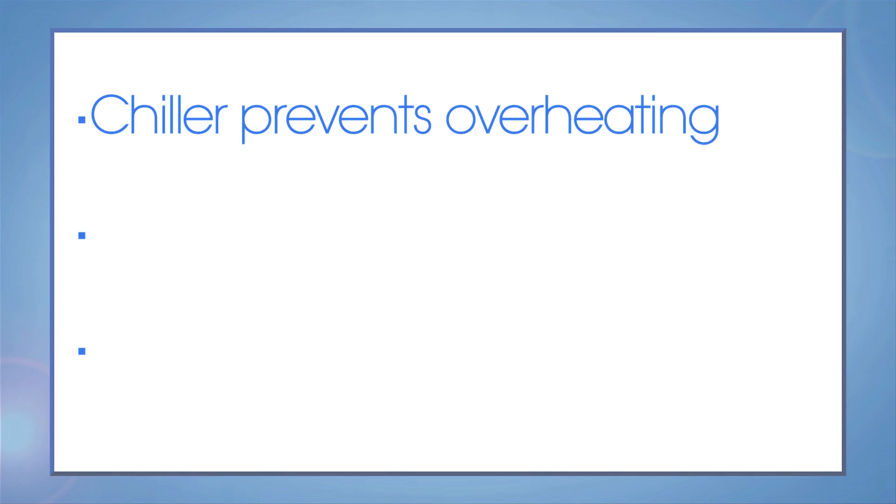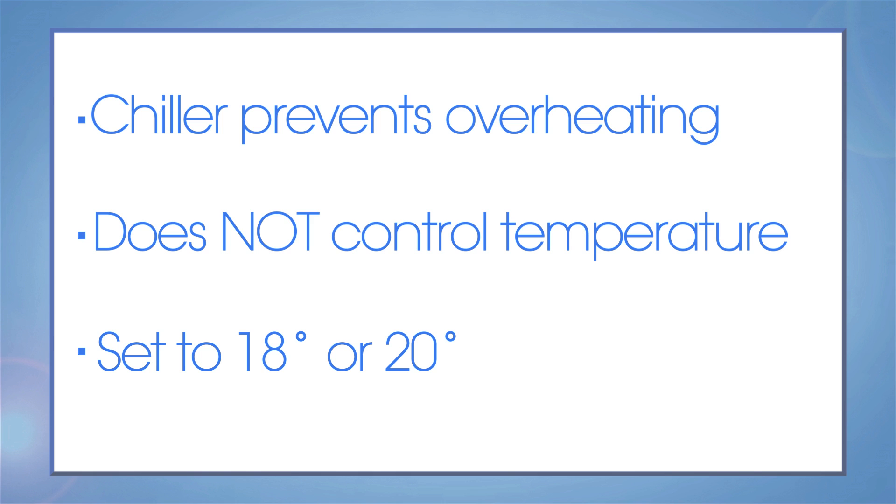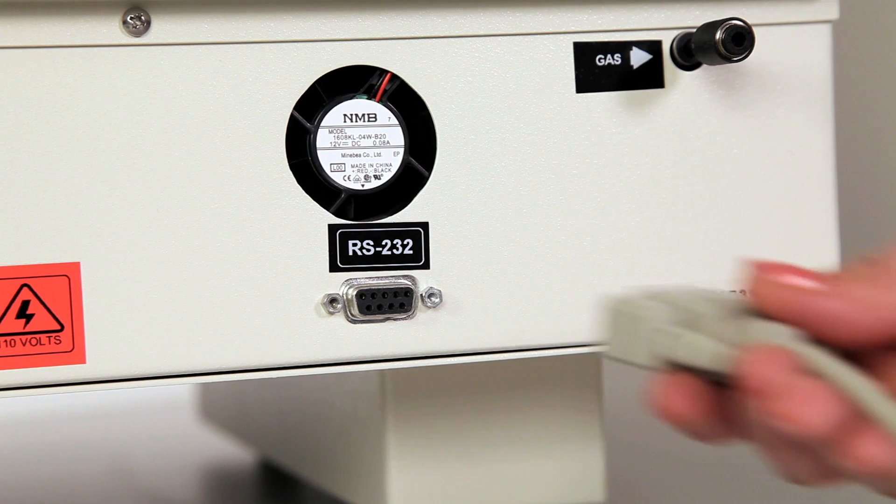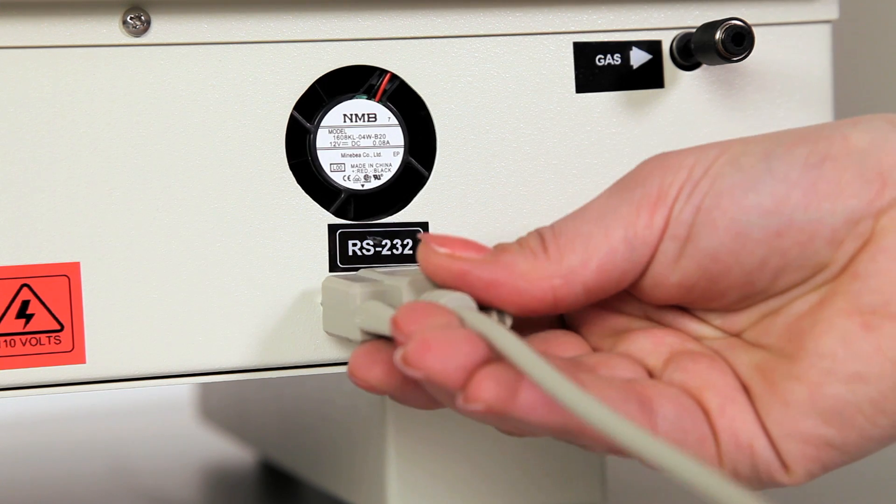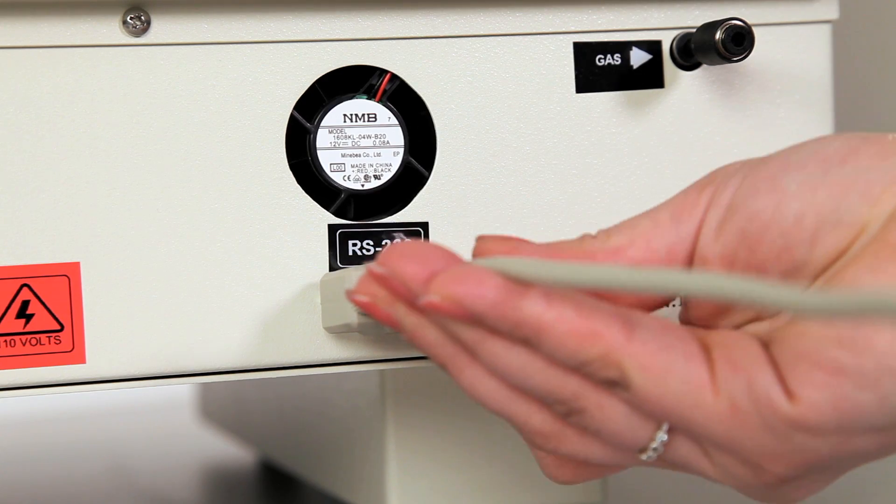The chiller is used to keep the system from overheating and is not used in temperature control, so you can set it to 18 or 20 degrees C. Then we connect the RS232 to our instrument and the computer.